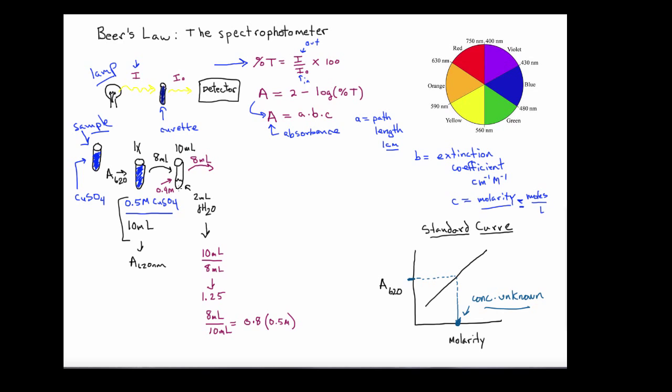And then what we're going to do is we're going to take 8 milliliters of this. Remember, after you've mixed this solution, you'll take the A₆₂₀ of this. So you're going to have the absorbance for this and the absorbance for the 1x. Now you're going to take 8 mils and you're going to go to a new tube. And the way I do this is I already have this preset up so that you've got 2 milliliters of distilled water already in it. So the new volume of this is 10 milliliters. Now we have the same situation here that we had in the previous dilution. So we've gone from 8 milliliters to 10 milliliters. This solution is 1.25 times more dilute than the previous one or it's at 80% again, 0.8 of a 0.4 molar solution. So the new concentration here is going to be 0.32 molar of copper sulfate.